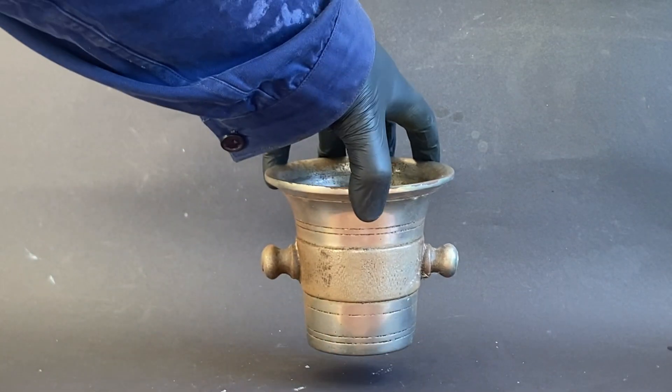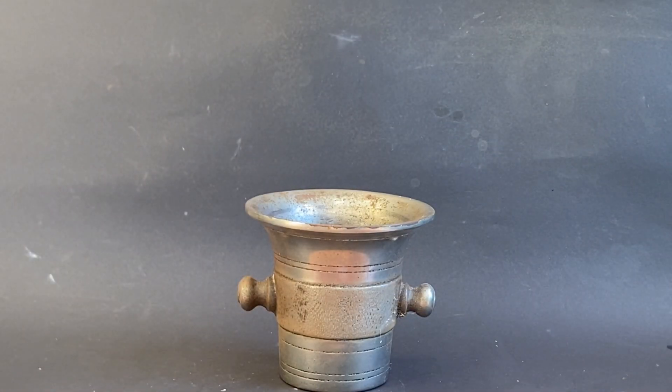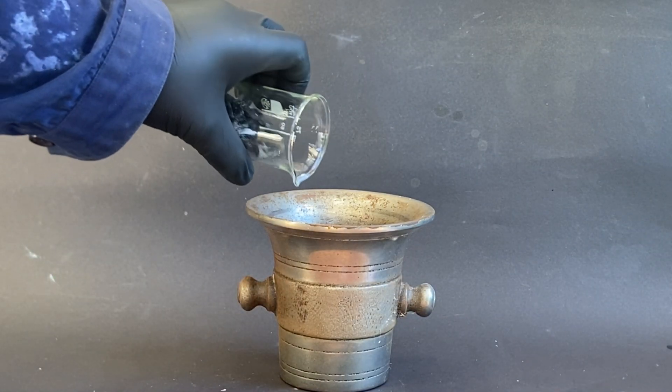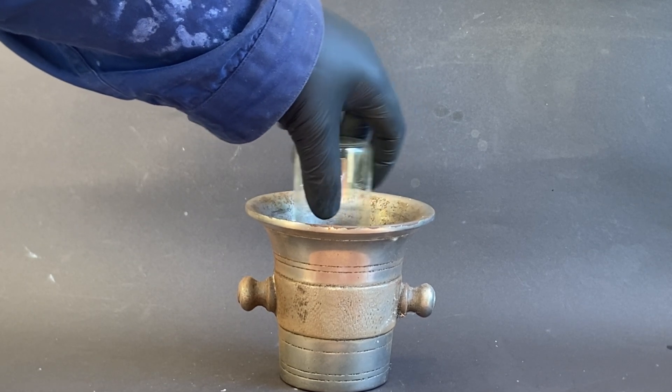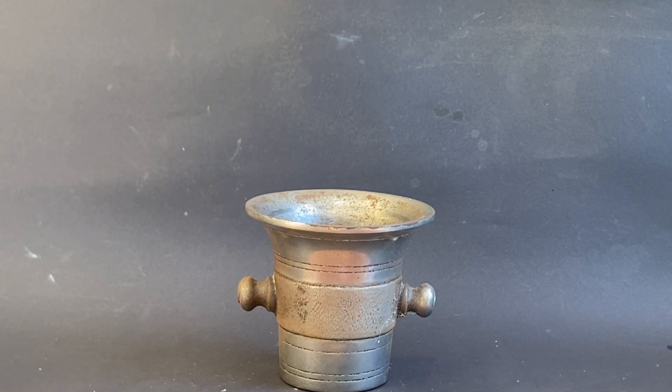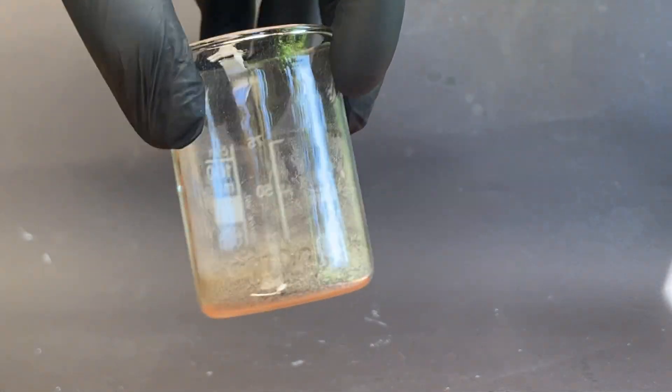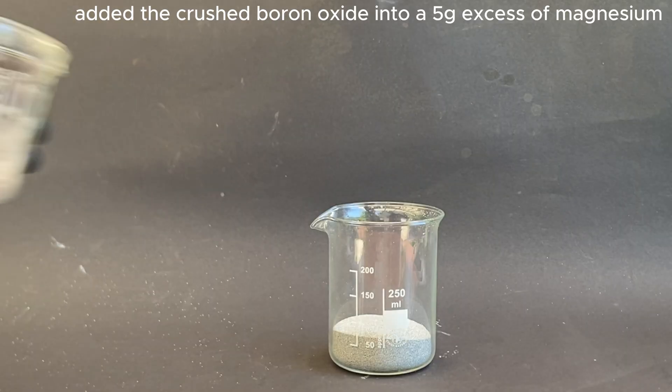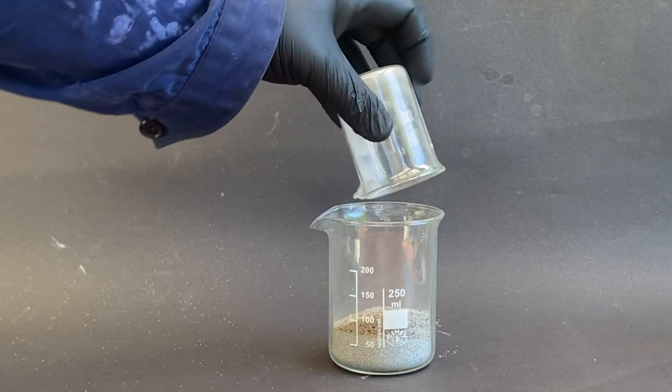Next I crushed the boron oxide into a fine sand. After that, I mixed the boron oxide sand with a 5g excess of magnesium.